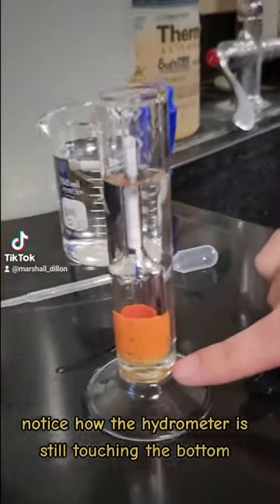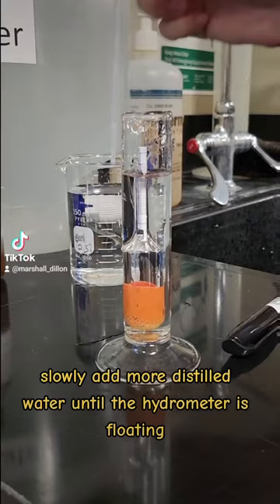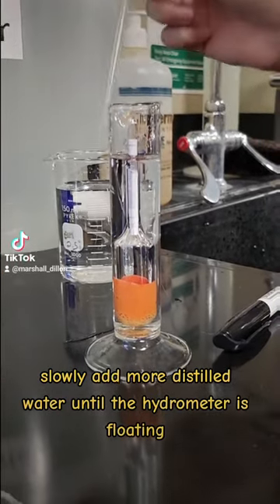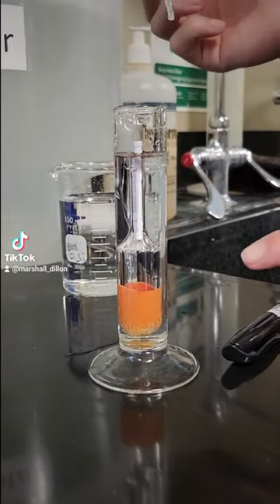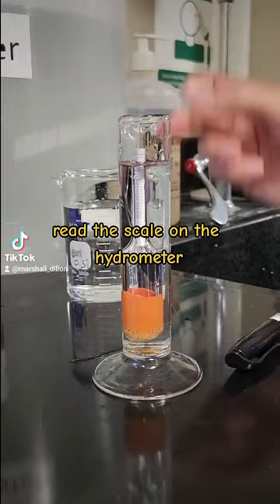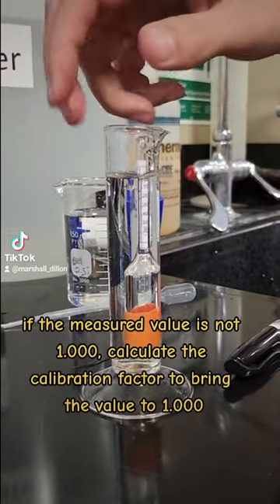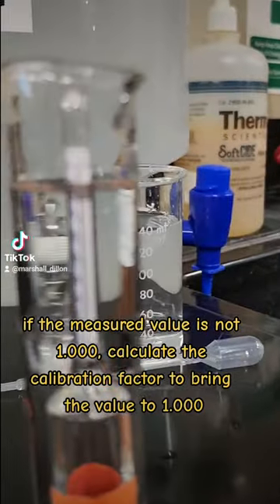Notice how the hydrometer is still touching the bottom. Slowly add more distilled water until the hydrometer is floating. Read the scale on the hydrometer. If the measured value is not 1.000, calculate the calibration factor to bring the value to 1.000.